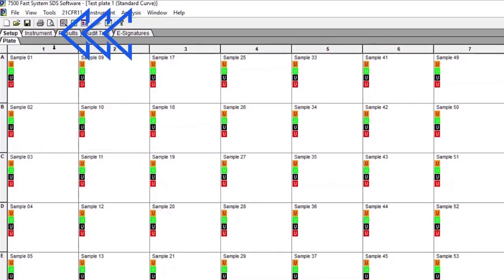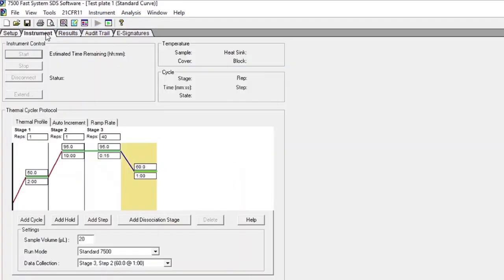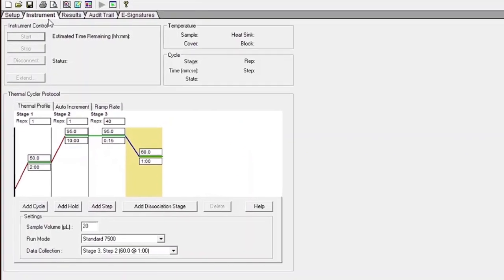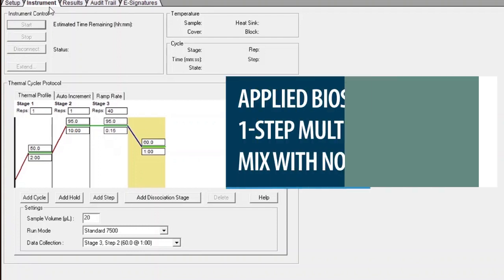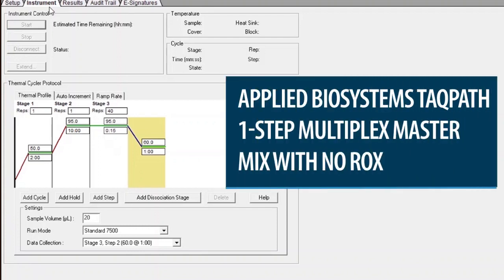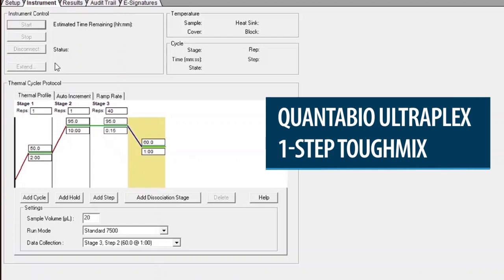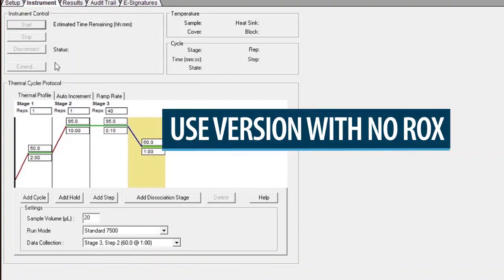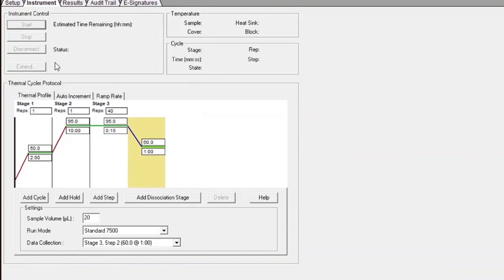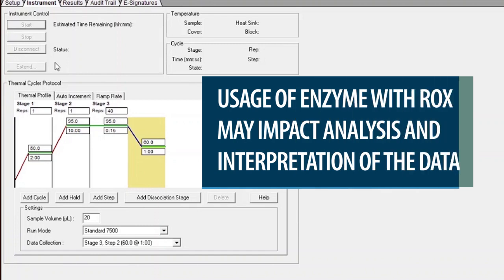Click on the Instrument tab at the upper left corner of the screen. Modify the thermal cycling conditions based on the enzyme being used. The two enzymes currently approved for use with the FLU SC2 Multiplex Assay are the Applied Biosystems TaqPath One-Step Multiplex Master Mix with No ROX, and the QuantBio UltraPlex One-Step Tough Mix. If you are using TaqPath, please be sure to use the version with no ROX, as the SARS-CoV-2 data is collected in the ROX channel, and usage of enzyme with ROX may impact analysis and interpretation.